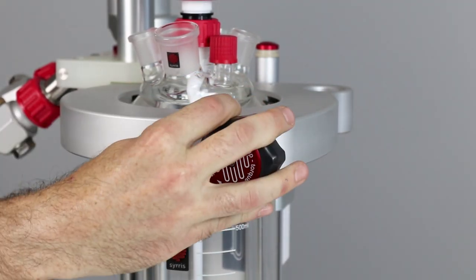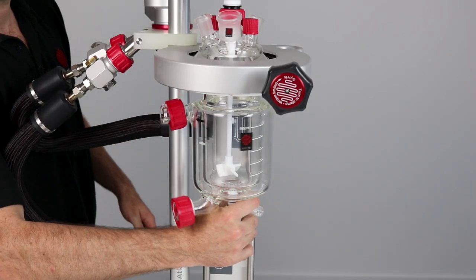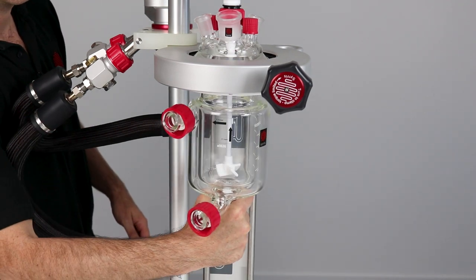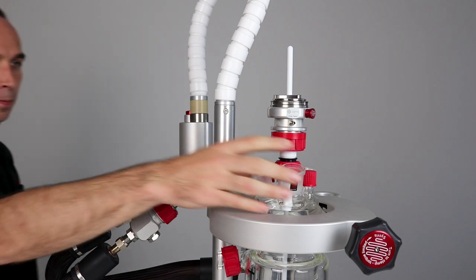As you can see the clamp holds the vessel and lid even when the clamp is open allowing excellent access to the vessel and meaning you can leave all probes in the lid when the vessel is removed for cleaning saving you valuable time.